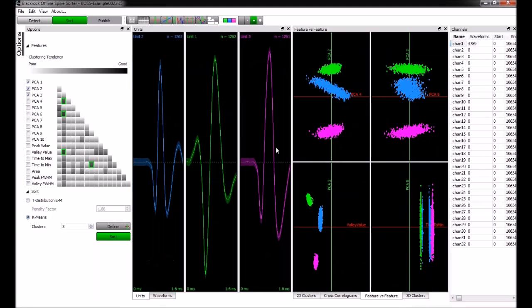Thanks, Nick. Another good question is that I record both NEV and NSX files at the same time, obviously. And then offline, I want to be able to load my continuous file, do re-thresholding and do sorting, but my NEV file also contains important information like tracking all the digital I/O inputs. If I save the sorted NSX file, it will create a new NEV file, and I'll lose the data from my other NEV file. How do you fix that? How do you combine them?